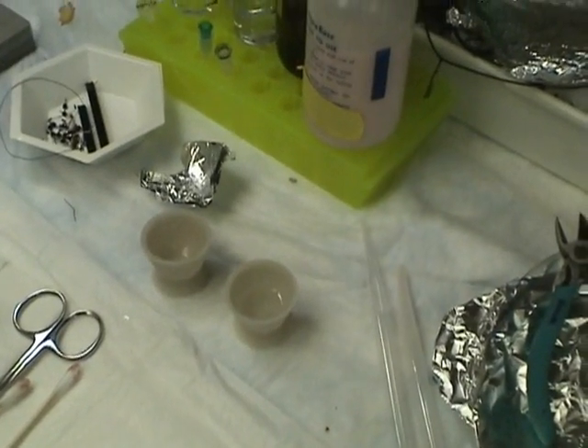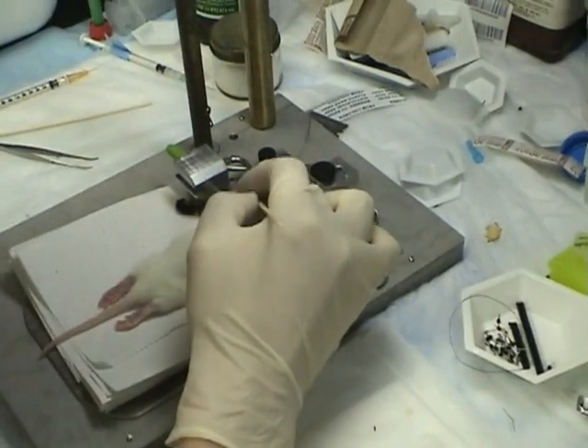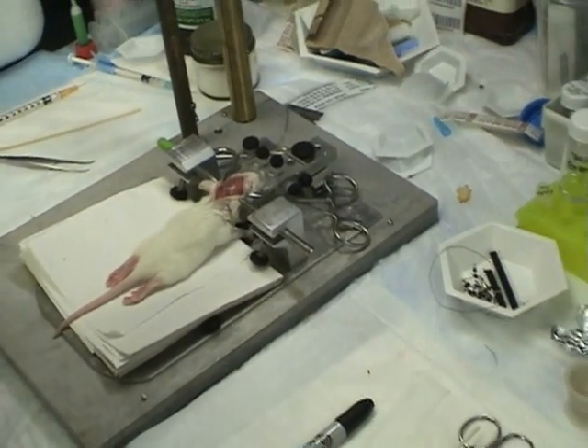The perfect thing is no blood — that's the best. I'm going to put the electrode.